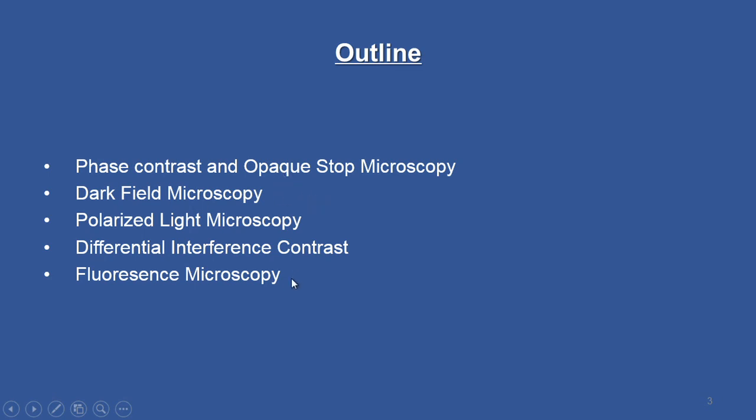I will go in this order, and we will show similar live demonstrations, like we have seen for bright field illumination, for all these variants. Before I begin phase contrast microscopy, a very similar technique is opaque stop microscopy.